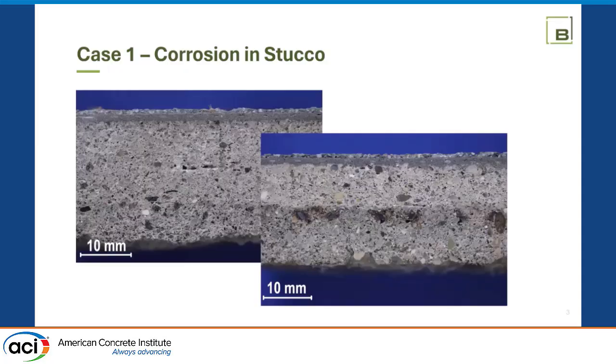That perked my ears up and said, let's run a chloride by C1218, water-soluble chloride. And we found out that indeed we actually have 0.1% or 1,000 parts per million of chloride, which if you factor that in as a percent by binder, you're looking at about 1.5%.